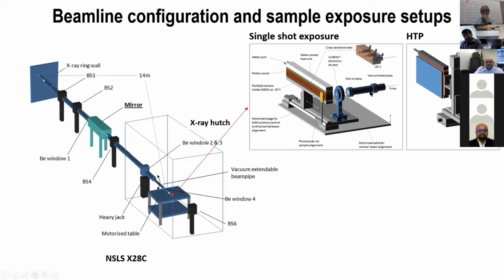And now Eric will talk more about this one. He has developed a high throughput 96-well plate version of this. So you give the sample here in a 96-well plate, and he does the exposure using a millisecond shutter.